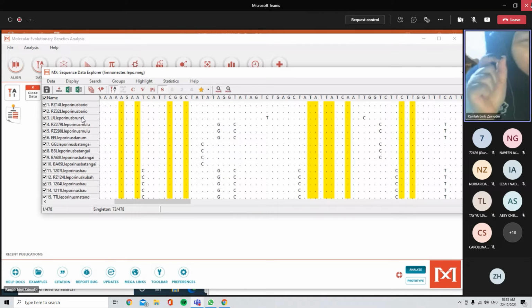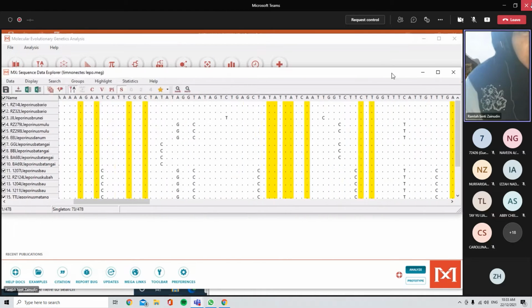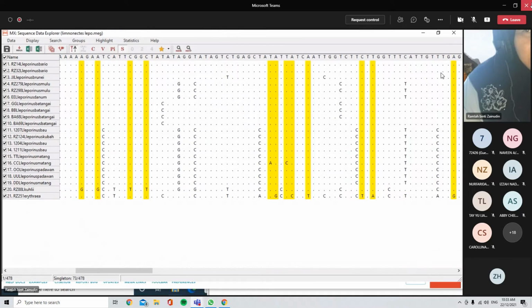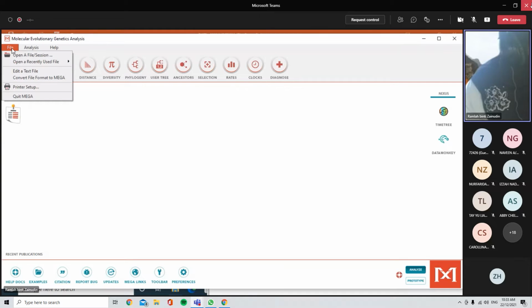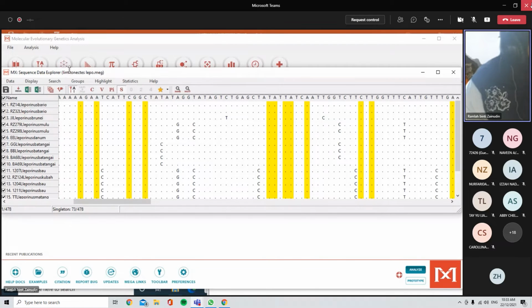You can actually detect those who know about molecular phylogenetics and those who do not, by looking at how they write the data set. Alignment, because when you publish as a thesis or as a journal, we want a data alignment data set. Sometimes they just take this and do a print screen. When you have a print screen, you cannot see. You can only see the variable set when you have it like in Excel. But I'm not sure where for this new version, how do you write the data file?